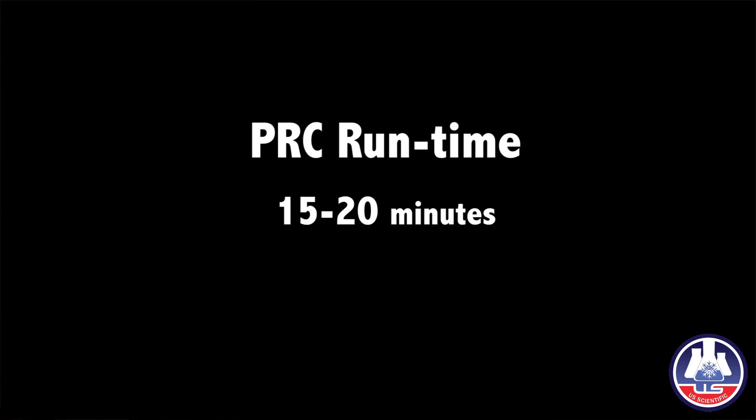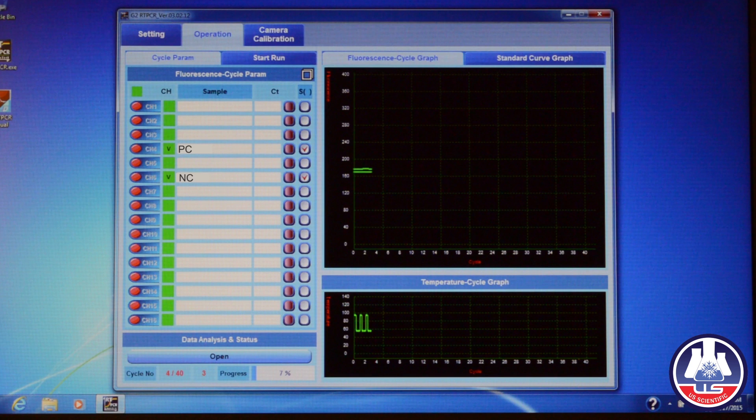During this time, when you go to the cycle parameter tab, you can check your sample or you can save your sample name.